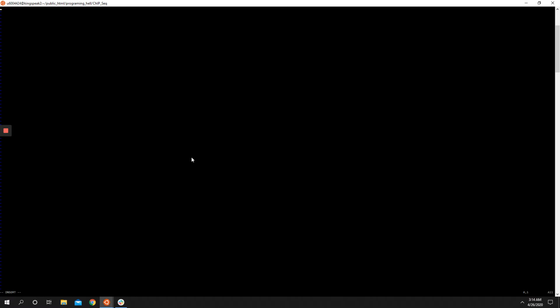Okay, so typically the thing you should do when you write a script is tell the script exactly what it's going to be used to interpret it. This is called a shebang. You can remember it's a hash and then a bang, exclamation mark, and then you give it a path to the interpreter, which, if it's bash, will be in the root bin directory.